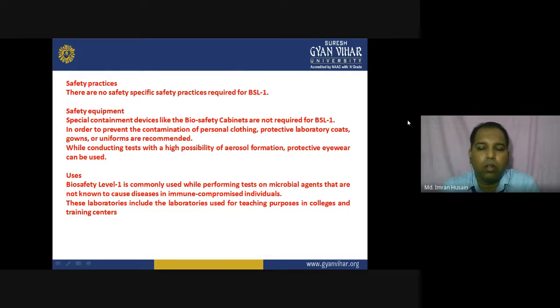All these items like laboratory aprons and other clothing are meant for the personal safety and security of the individual, because during the experimentation process you don't know when you are going to spill some chemicals, or when you can get a splash from an acid or any other harmful chemical. So in that whole process you are protected under that lab coat.